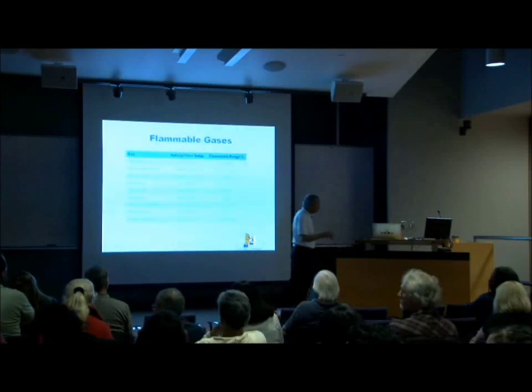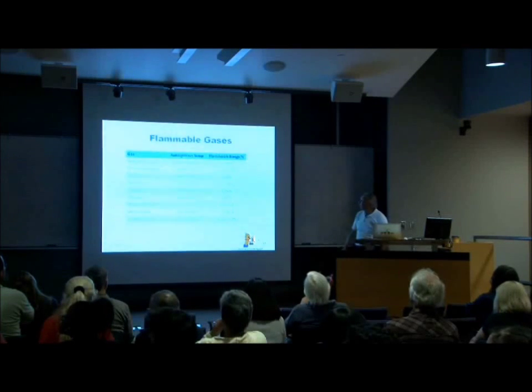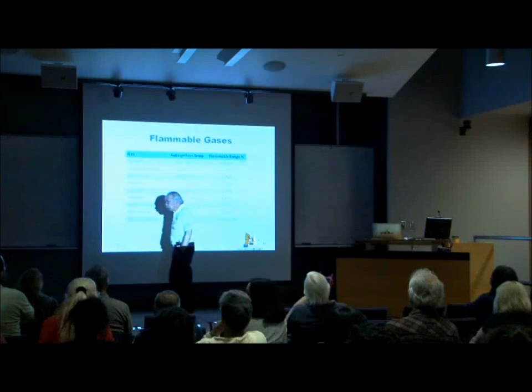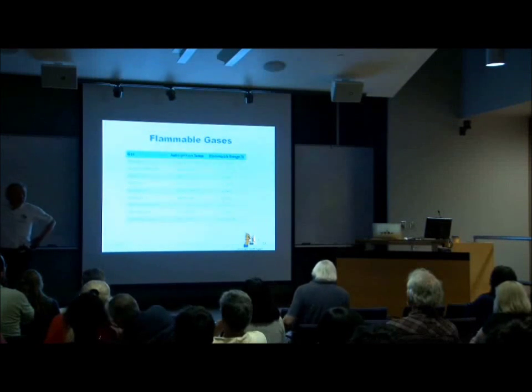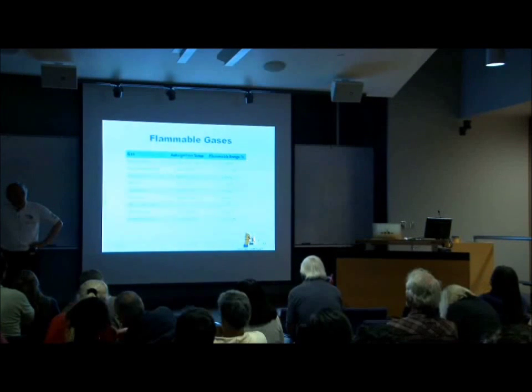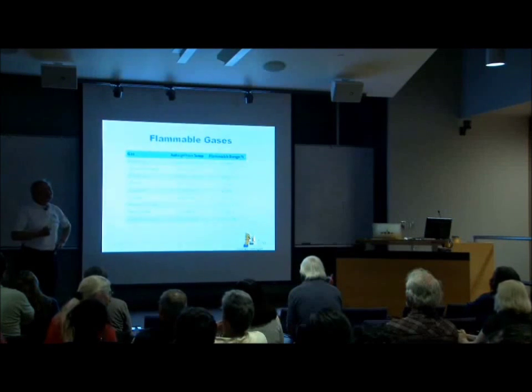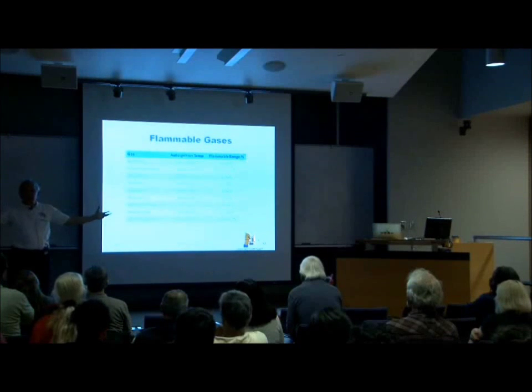Hey, Eugene. Yes, sir. Talk a little bit more about CO, because it's got other properties which also aggravate not just the flammability, but the toxic side of it. Yeah, CO, we're all familiar with CO poisoning, right? Especially when you have a burner at home that is not properly ventilated or properly adjusted. And CO poisoning is essentially, what's it called? It's called a chemical asphyxiant, right? In other words, you don't have to have an overwhelming concentration of CO to be asphyxiated.